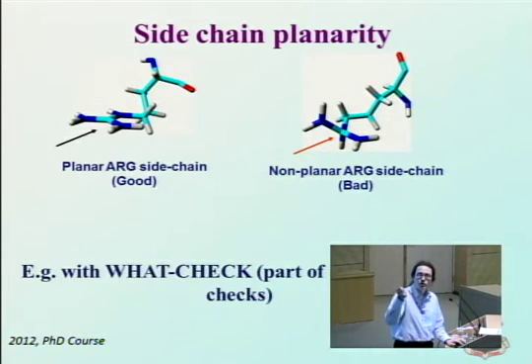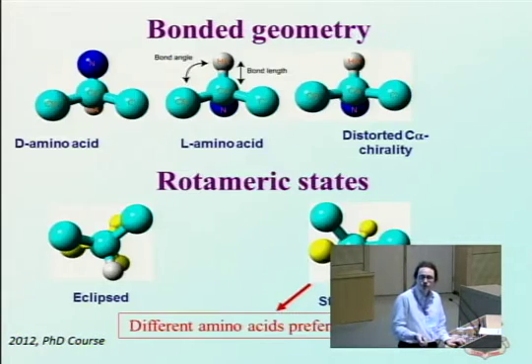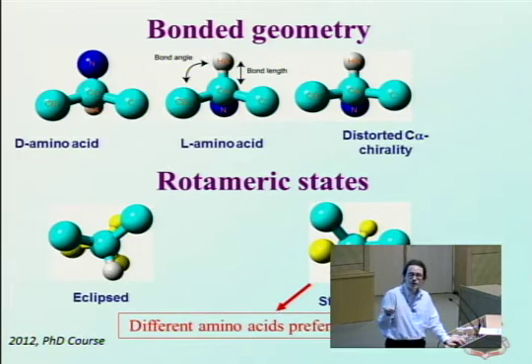But then when you go into, let's say, the refinement, if you actually have some local problems with the NOE network, you can get distortions. Bonded geometries, again, when you do the refinement, sometimes you can get inversion of chiralities. This is, I have to say, now very uncommon. It used to be more common when the force fields were less accurate than they are today.